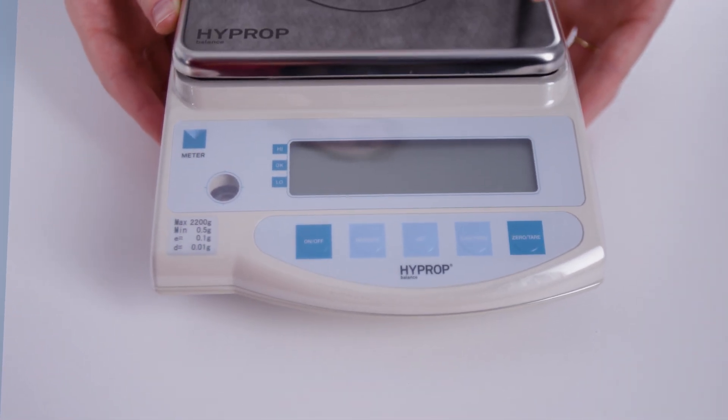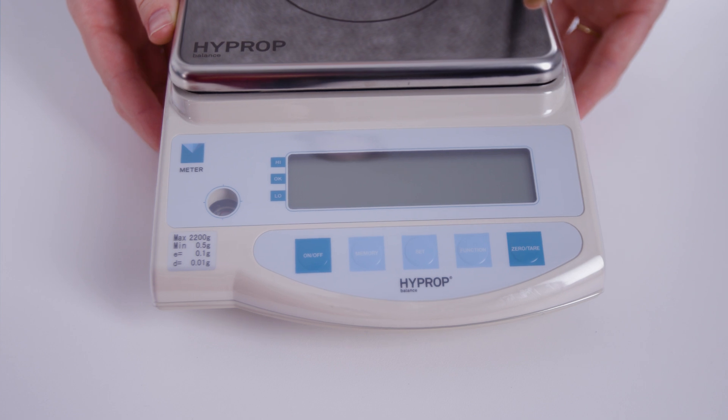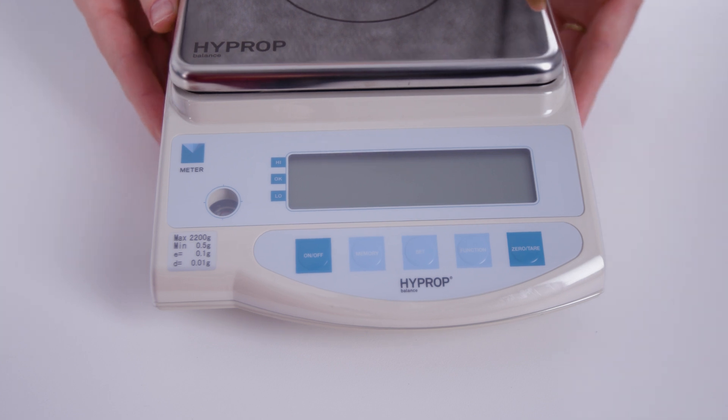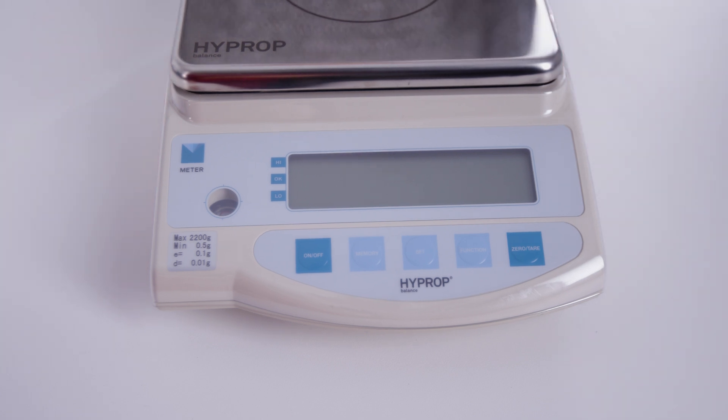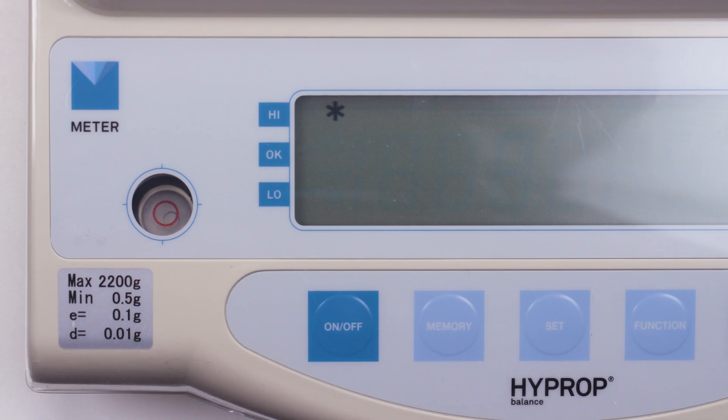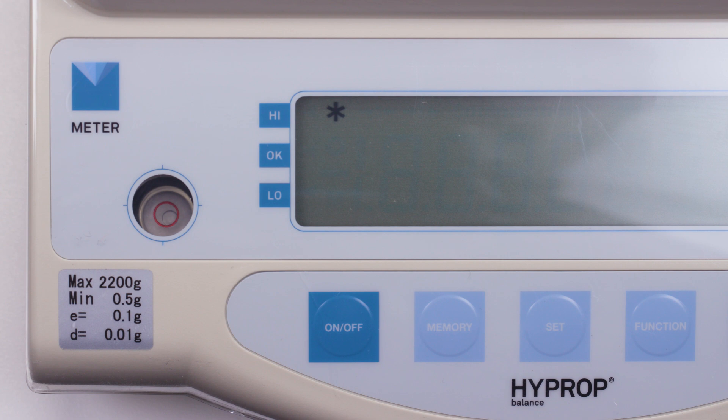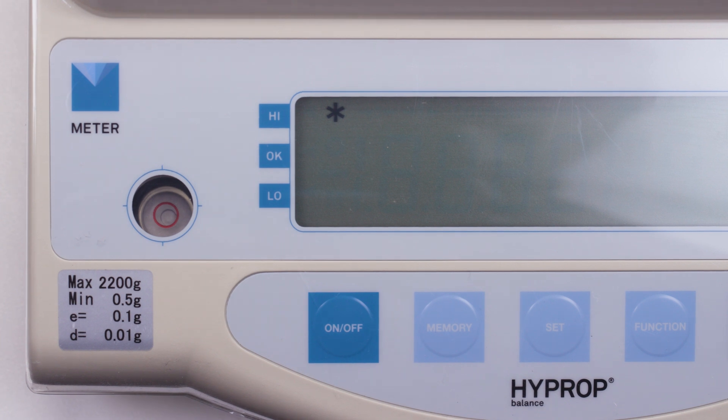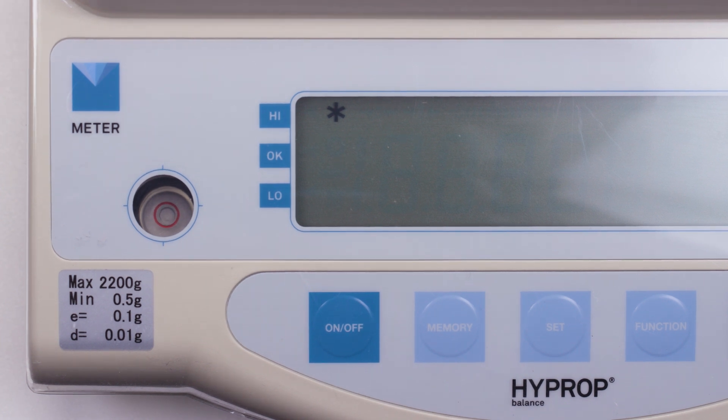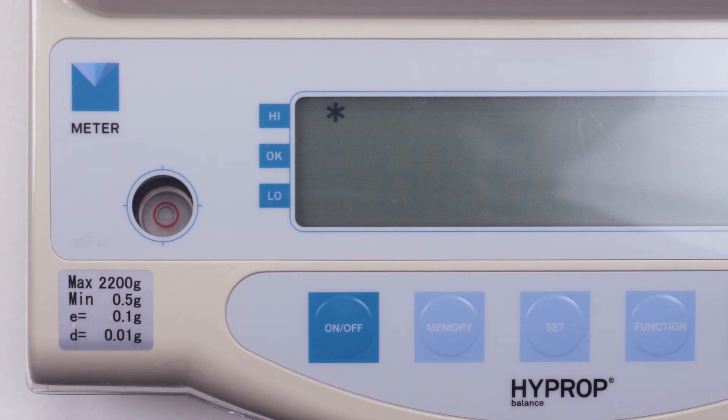To prepare the balance, set it on a vibration-free workplace. Set up the balance horizontally and level the balance by adjusting the balance feet. The air bubble should be in the center of the level.